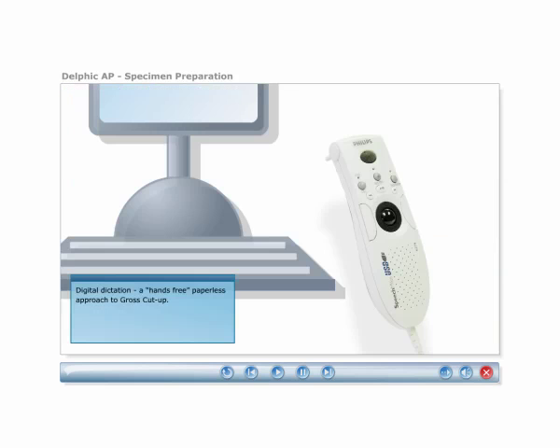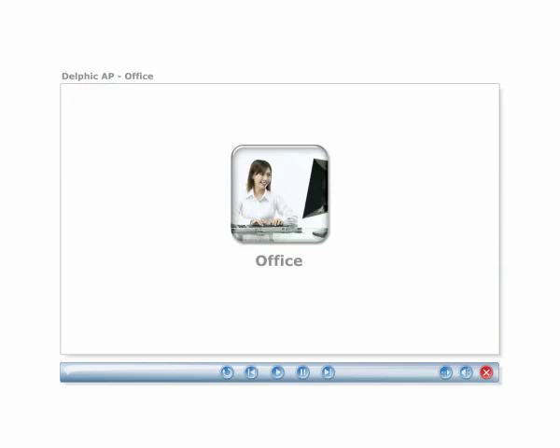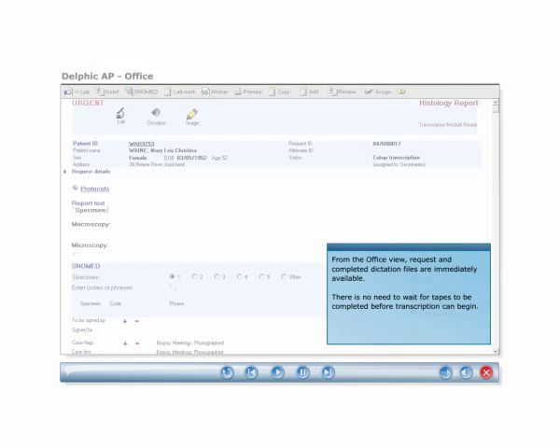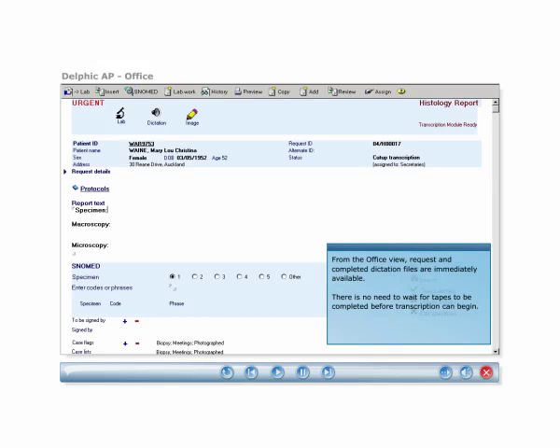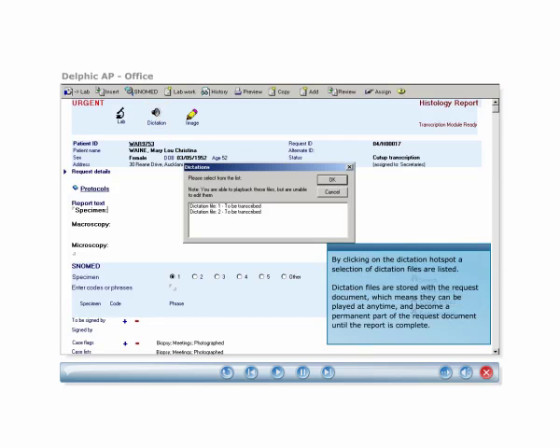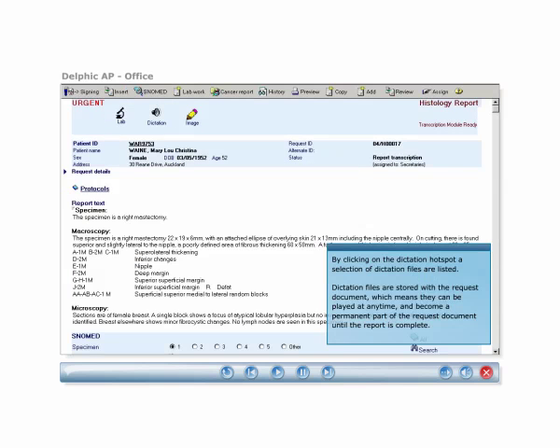Digital dictation provides pathologists with a hands-free paperless approach to gross cut-up. From the office view, request and completed dictation files are immediately available. There is no need to wait for tapes to be completed before transcription can begin. By clicking on the dictation hotspot, a selection of dictation files are listed. Dictation files are stored with the request document, which means they can be played at any time and become a permanent part of the request document until the report is complete.